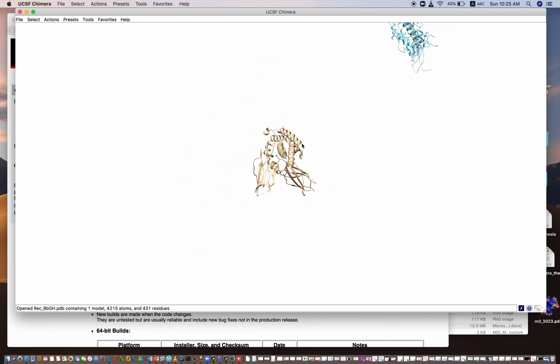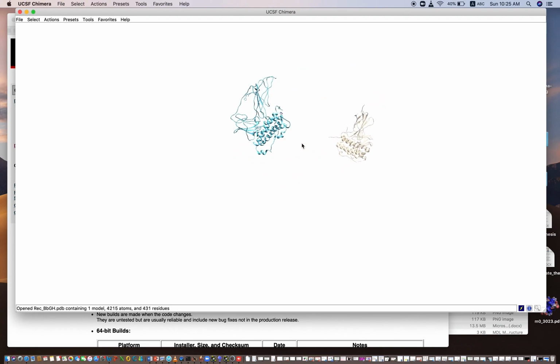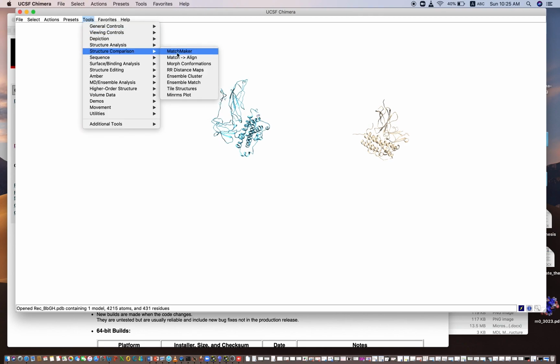I have uploaded both of them, and you can now see both have been uploaded. One thing is very important: the buffalo receptor is similar to the human one. We predicted the structure of the buffalo one by ourselves.